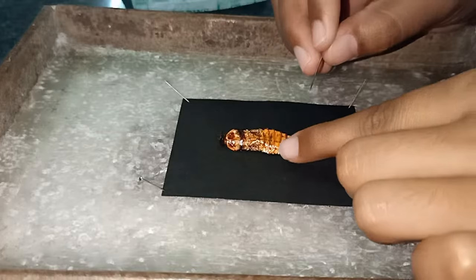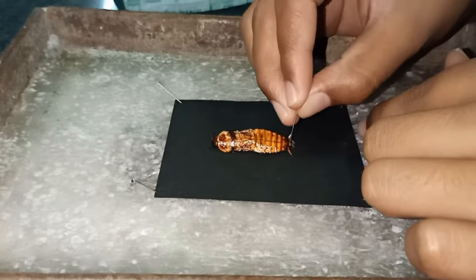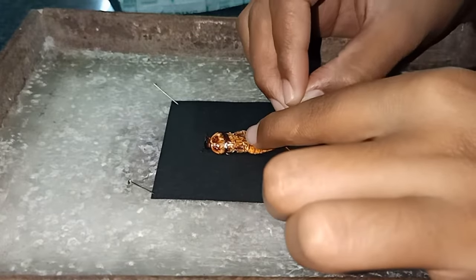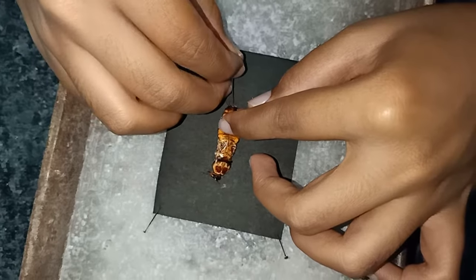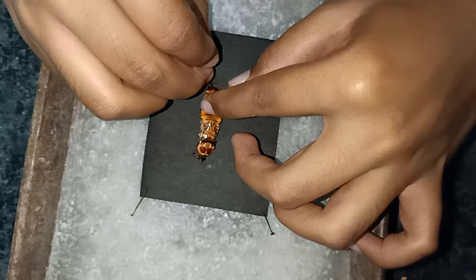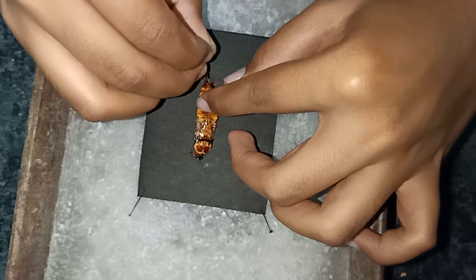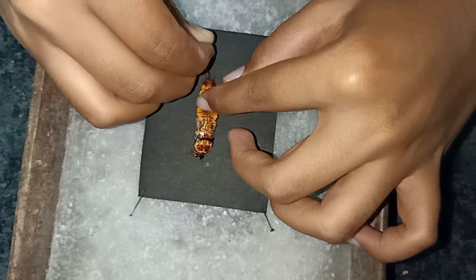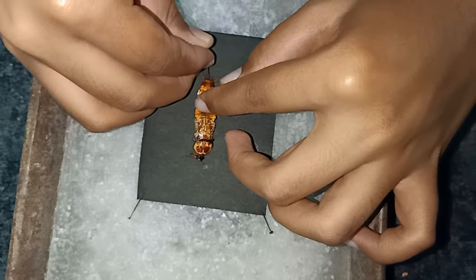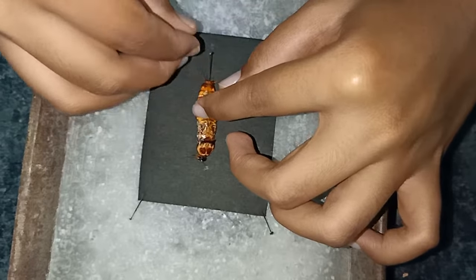After the clipping is carried out, place the cockroach on the black chart with its dorsal surface, which is the backside of the cockroach where the wings were present, facing upwards, that means towards us. The next step is pinning the cockroach in the black chart at the anterior and posterior region.